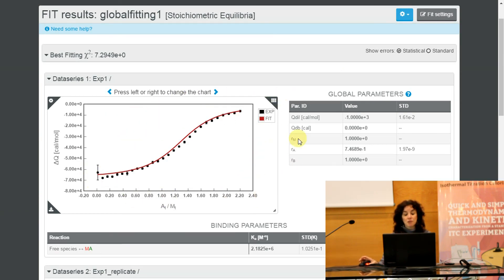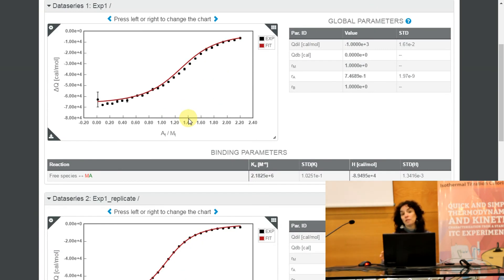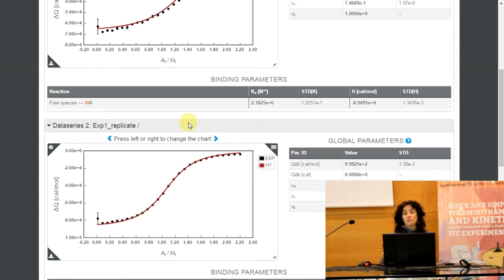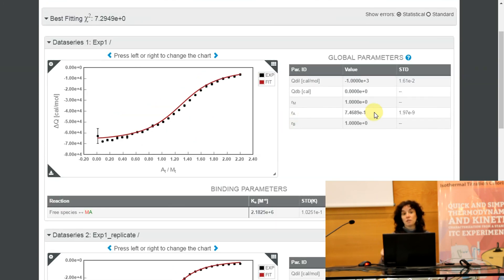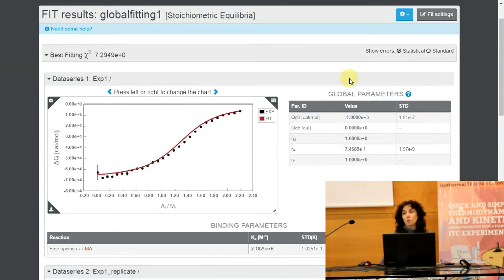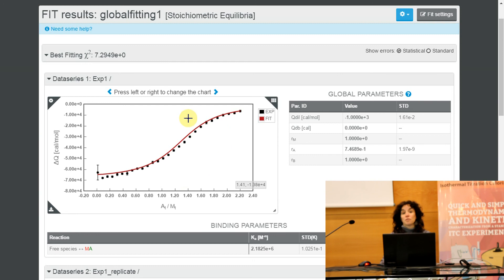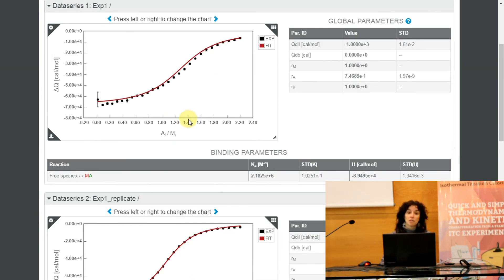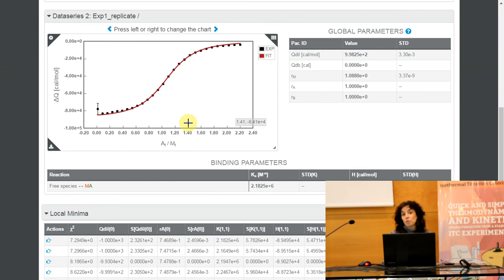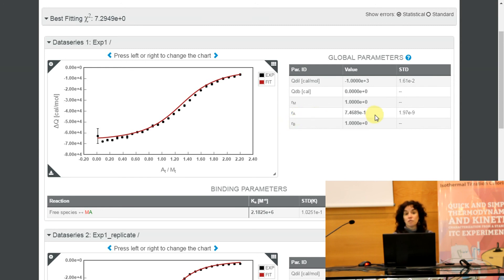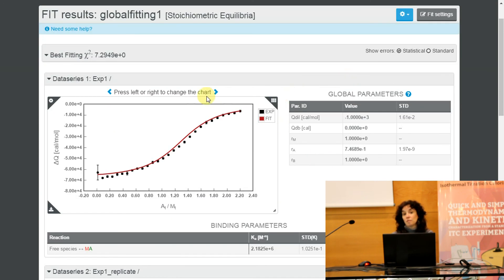This would be the simplest example of global fitting, but of course you can use global fitting to simultaneously fit many isotherms at the same time — 10, 20, as many as you want — and also to use global fitting as a potent tool for analysis of complex interactions. This was a simple case of one-to-one interaction and replicates, but typically you will be able to analyze very complex interactions by combining global fitting together with the model builder.